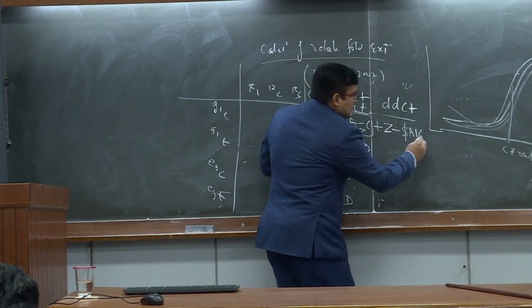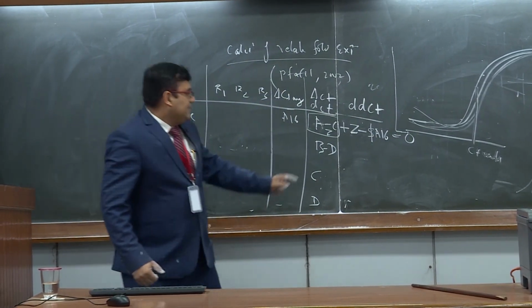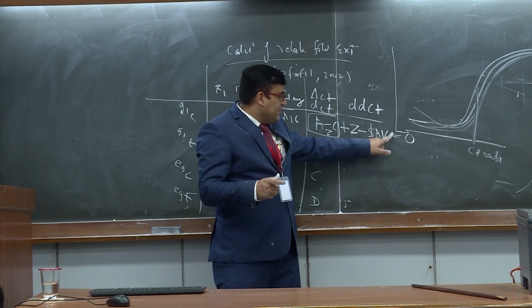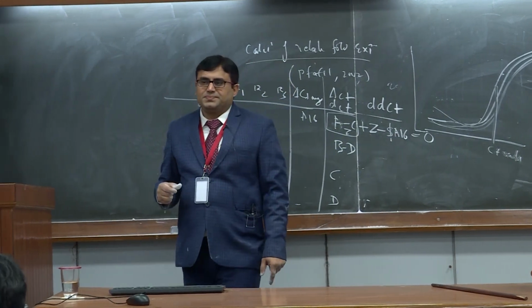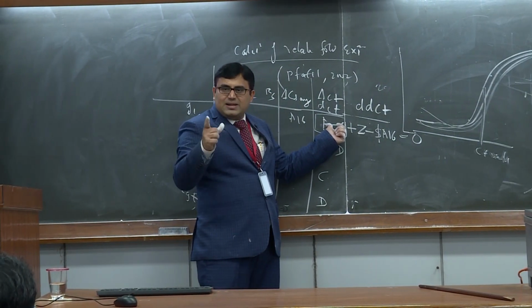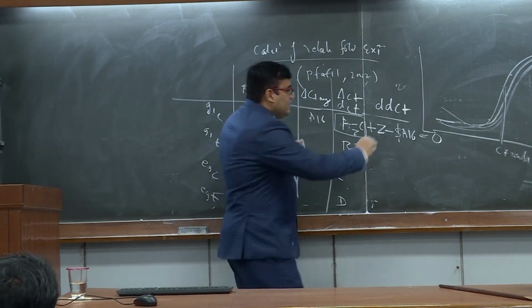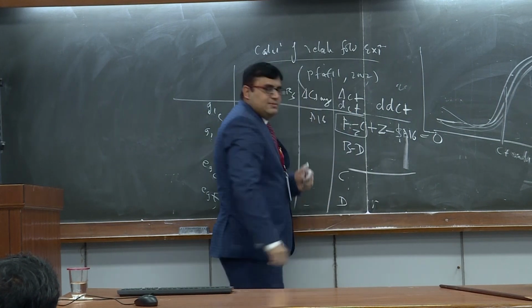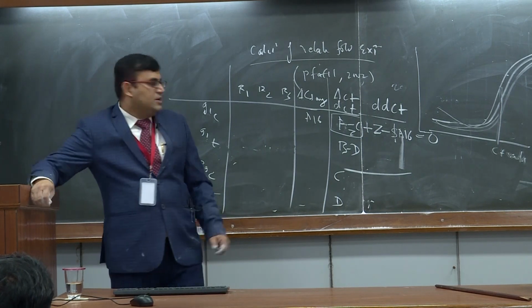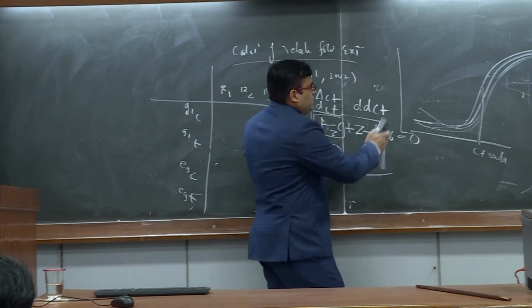The anchor means that once you drag, the reference stays constant, so the address of this minus the anchored address of this will be 0. Now you drag this. This value is called the DDCT value, the differential of CT values.